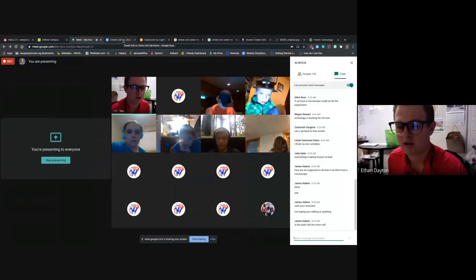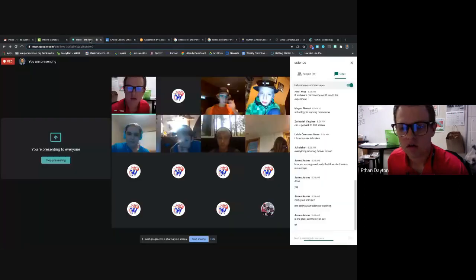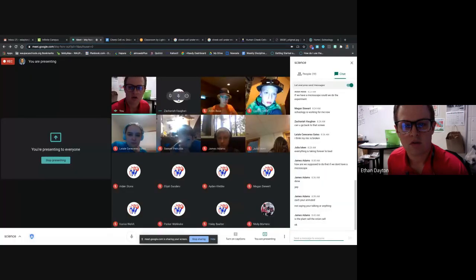Yes, James, the plant cell is the onion cell. Yep. What if we don't have a microscope?